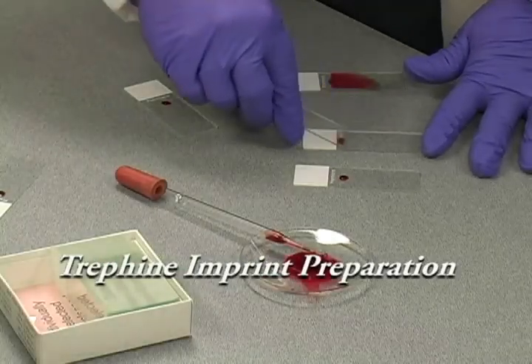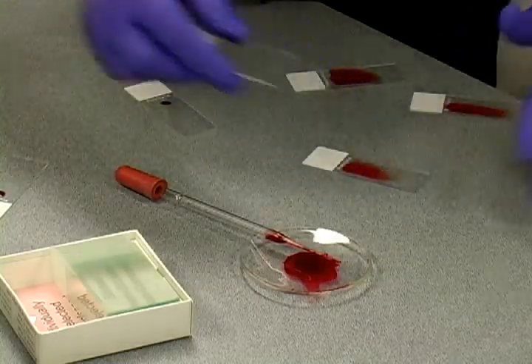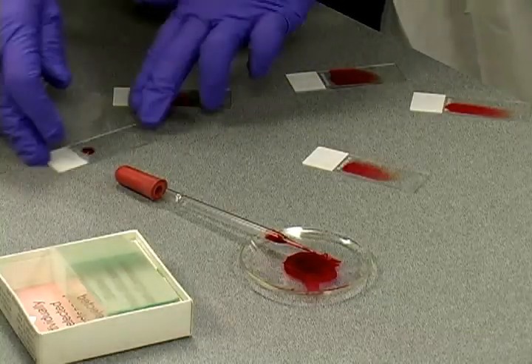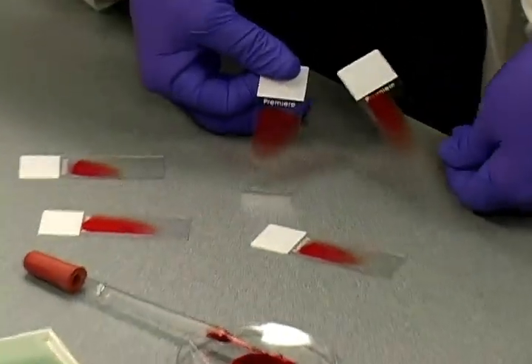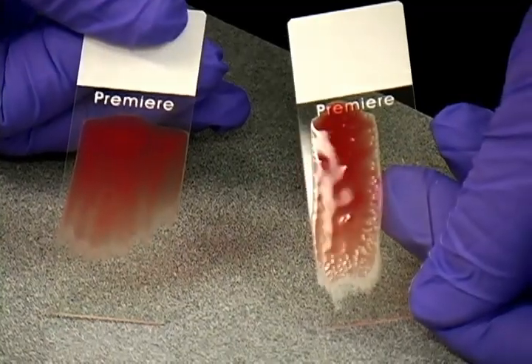An alternative spreading method is shown here. The edge of the adjacent slide is brought back at an angle to the marrow droplet. Once capillary action distributes the droplet along the angled slide edge, the slide is moved forward in a continuous action spreading the droplet. These slides are then allowed to air dry completely and sent to ProPath for staining.